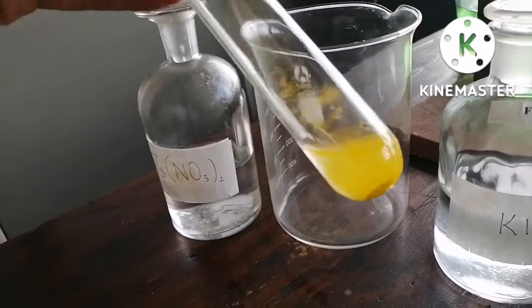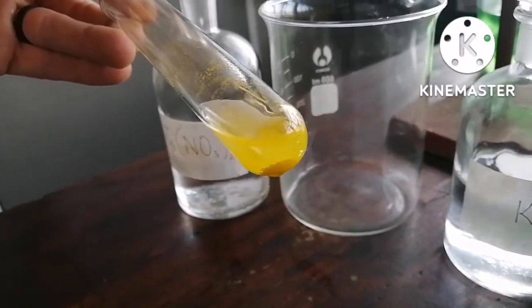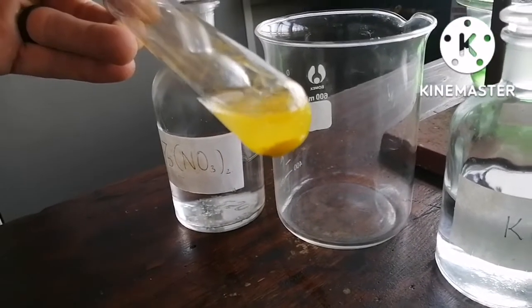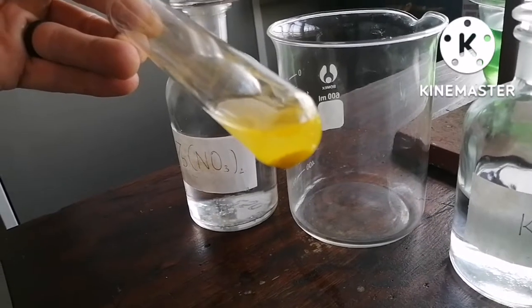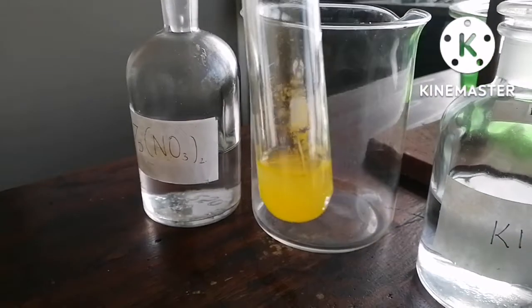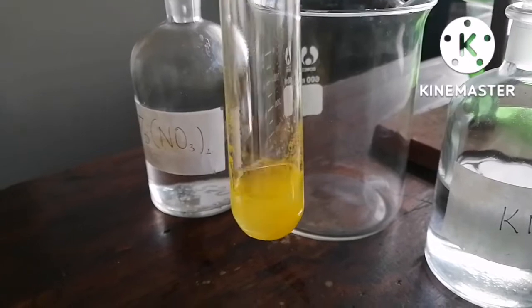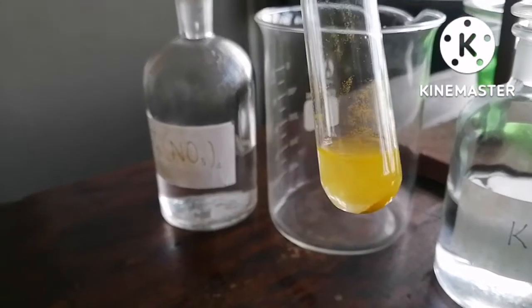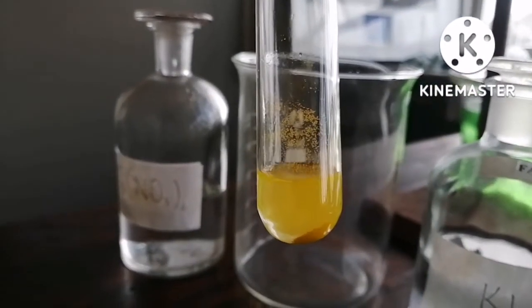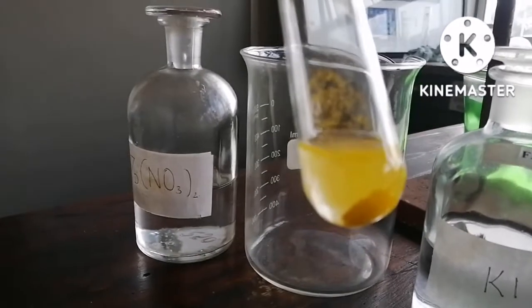Right, so we've just had a little bit of a wait now, and I've left the test tube to settle, and you can see that in the bottom of the test tube there is now a solid precipitate that gravity is pulling down. If I leave that for long enough, the liquid will eventually be clear, and all of the solid will go to the bottom. You can see on the side of the test tube, which is leaned up at an angle, that the solid is stuck to the side. So that is the solid precipitate.